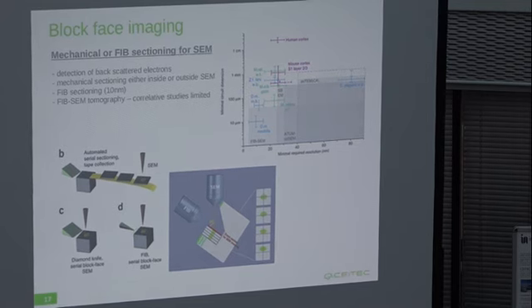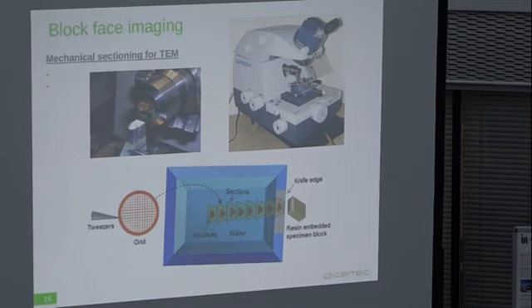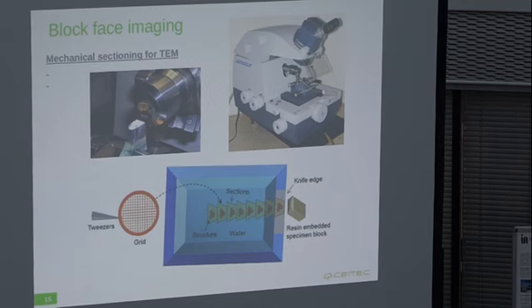Both ways, the utilization of an SEM might bring advantages over the mechanical sectioning for TEM, because the process will directly give you individual slices of your 3D volume, one after each other, without the need of fishing the sections on the TEM grid, which is error prone, and then you can also align the images, find the same regions, etc.